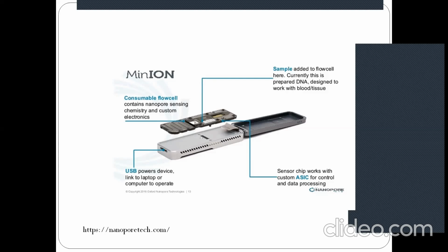Once you attach this system to the PC, it should not be just any one PC. It should be at least a workstation type, so that during the data acquisition your PC does not get into any sort of trouble. That is why the workstation has a high RAM capacity, so that the data can be processed very fast.